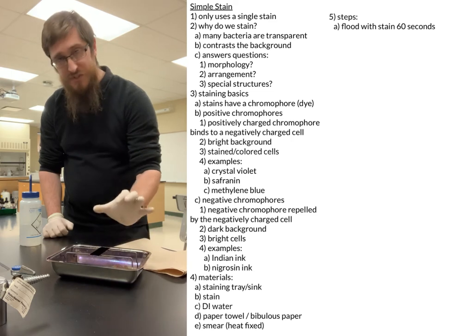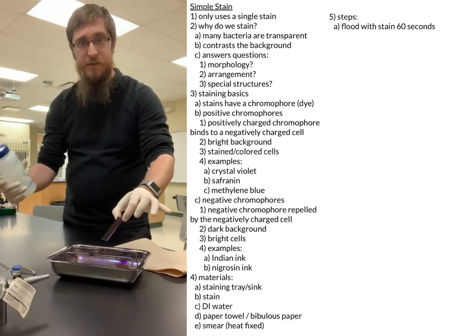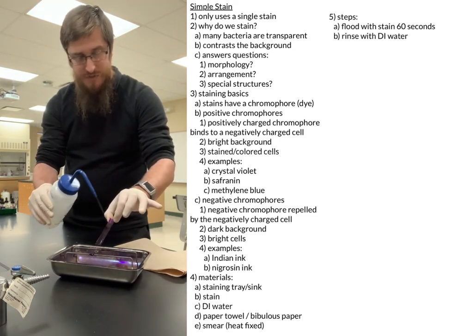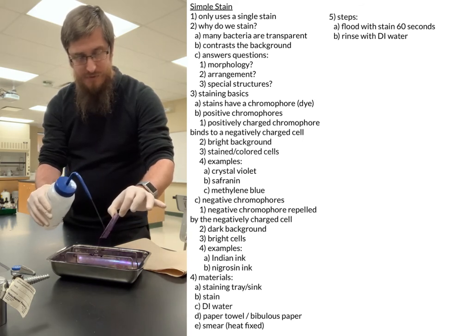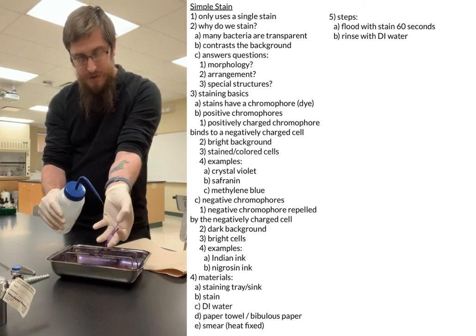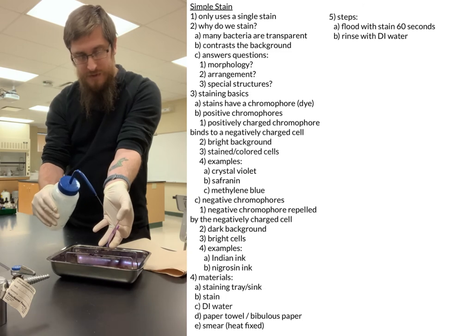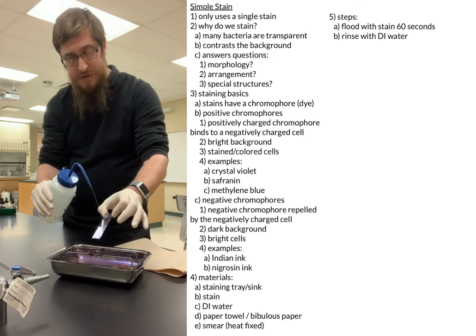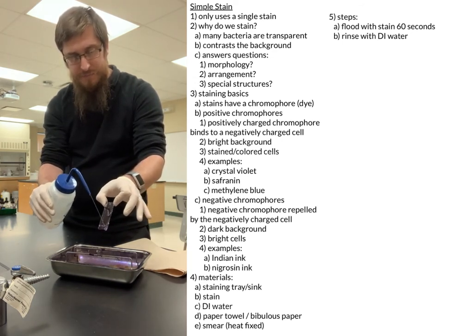Once your 60 seconds are up, you're going to take the slide and tilt it at a 45-degree angle, and you'll take DI water and gently rinse down the slide. You want to stay away as much as possible from the middle where your sample is. You want to let the water run down over the slide rather than actually washing off the sample in the middle. So we're just going to let the water run down until it looks fairly clear.